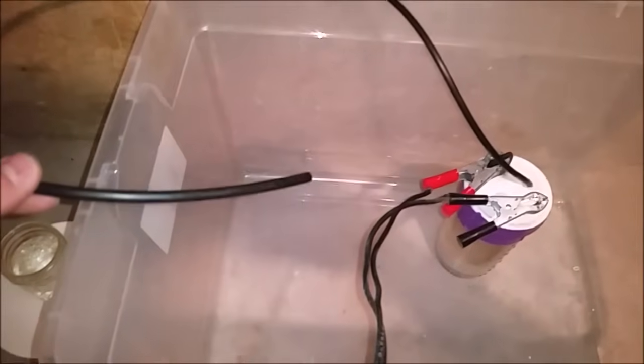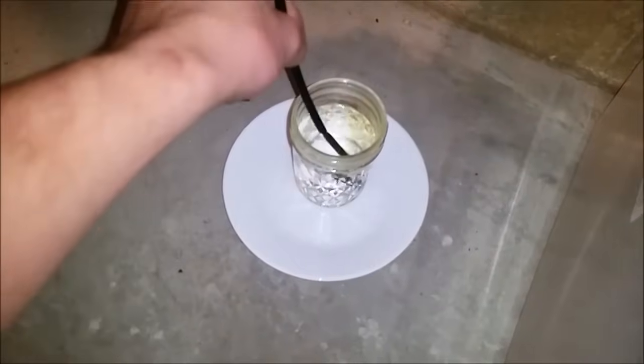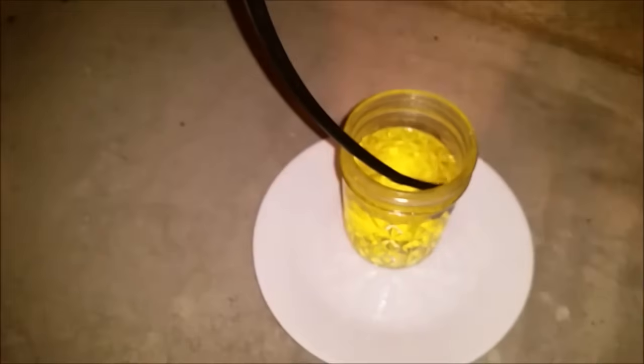Now this is producing chlorine gas so along with being in a well-ventilated area I thought I might as well do something with the chlorine that is being produced. So I'm going to go ahead and bubble it through a solution of sodium bromide. Chlorine is more reactive than bromine so it replaces the bromine in the sodium bromide to form sodium chloride, and the bromine which is now in the elemental state is able to dissolve into the solution coloring it yellow, which will eventually turn to a reddish-brown as you can see here about half an hour later.